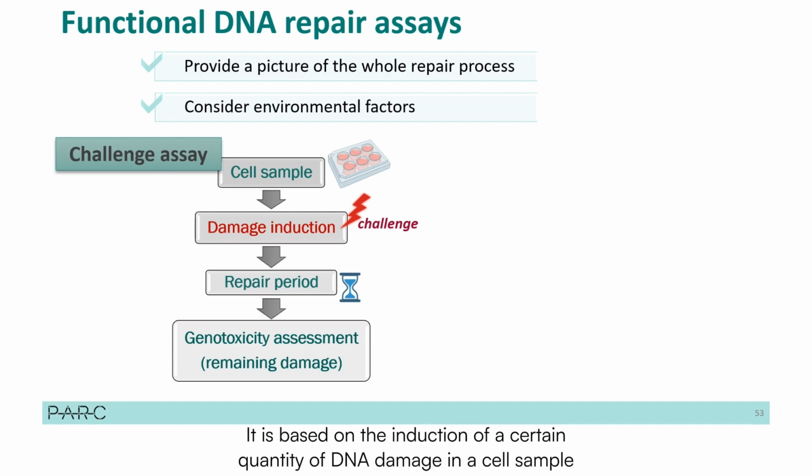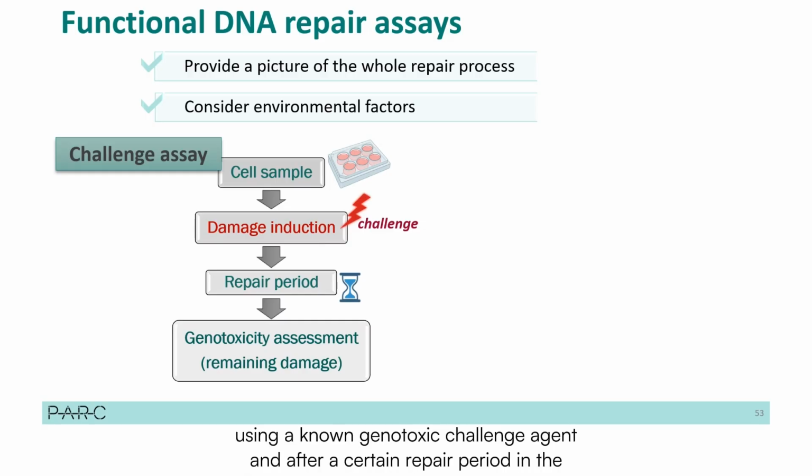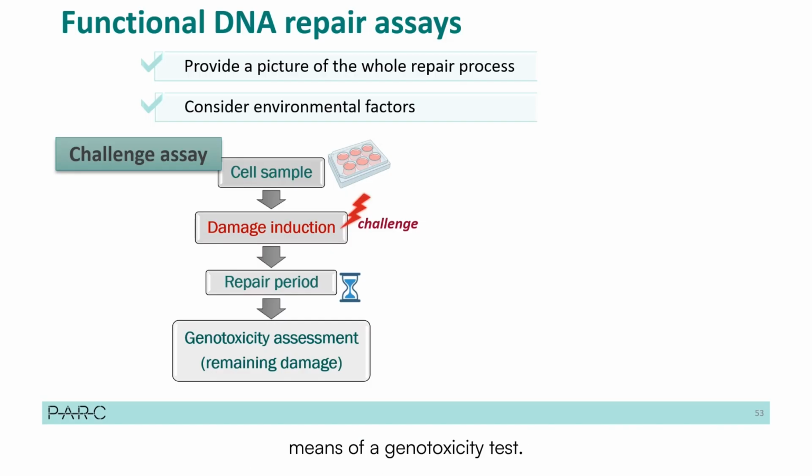It is based on the induction of a certain quantity of DNA damage in a cell sample, using a known genotoxic challenge agent. And after a certain repair period in the absence of the challenge agent, the remaining damage is evaluated by means of a genotoxicity test.